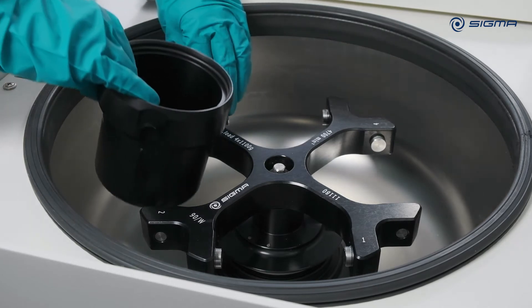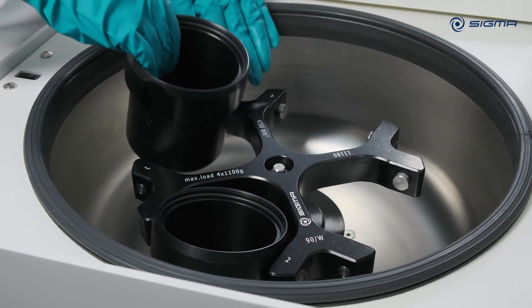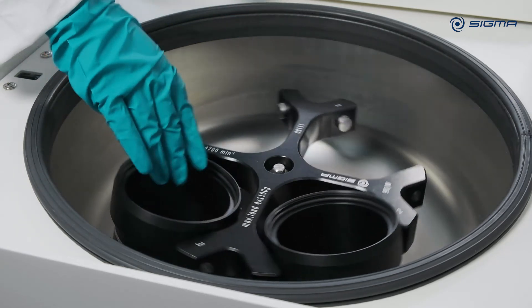Always fit buckets in all rotor locations to avoid imbalance. Always fit opposing buckets with the same accessories, or load them with the same filling.